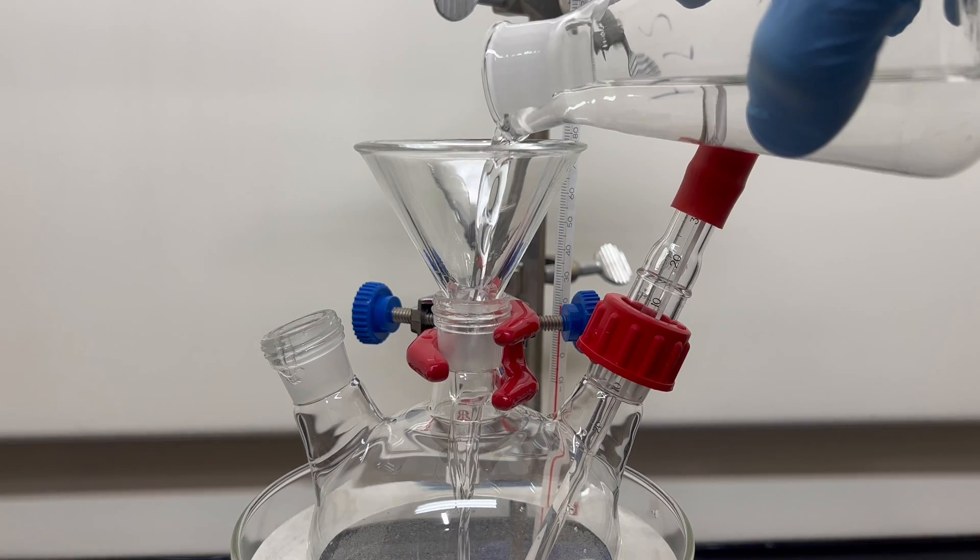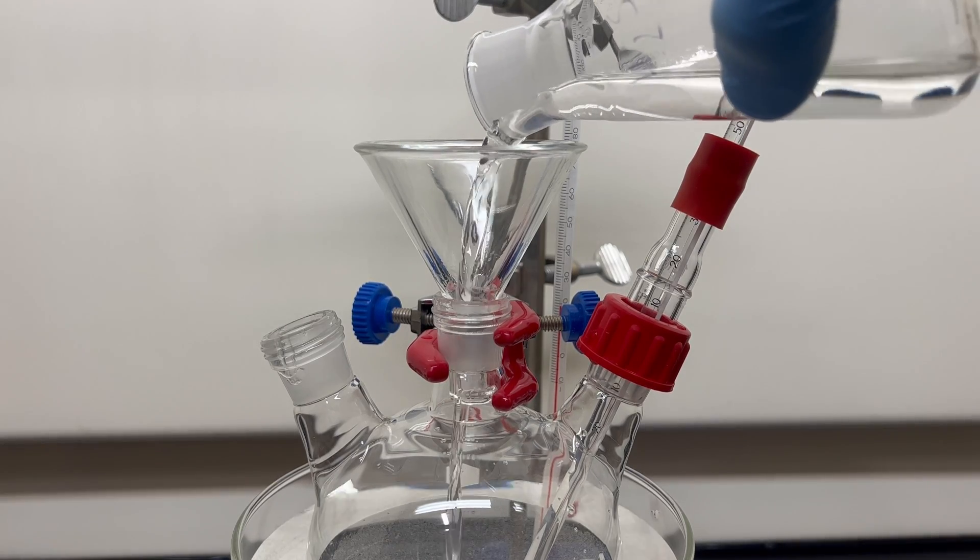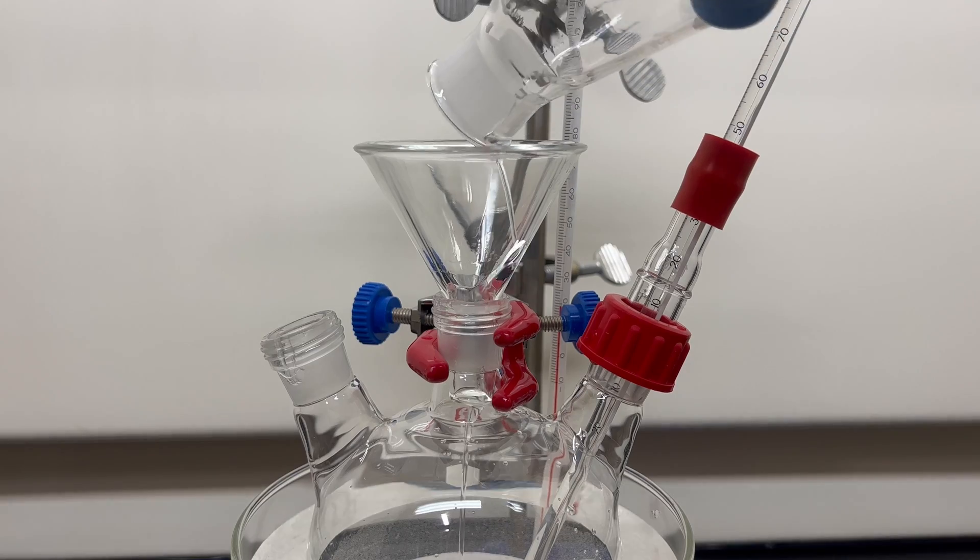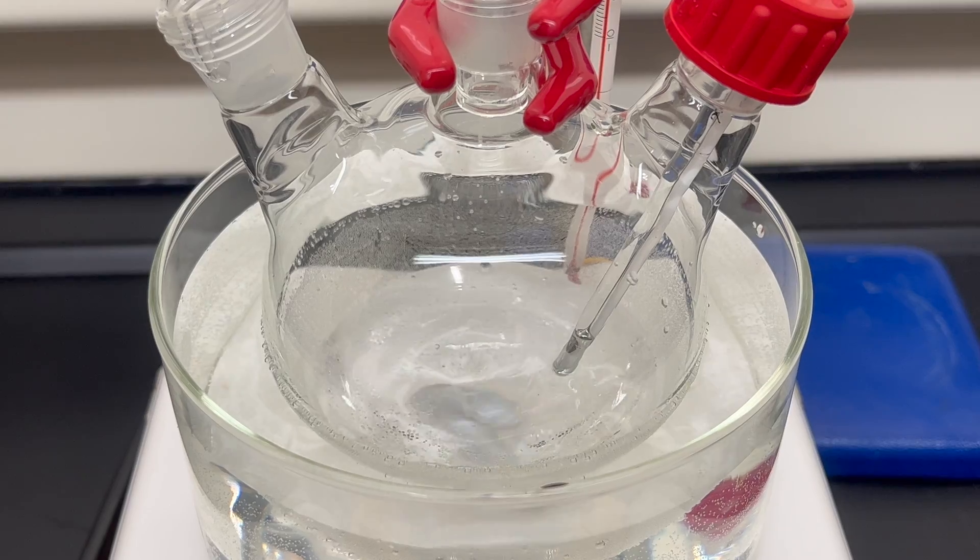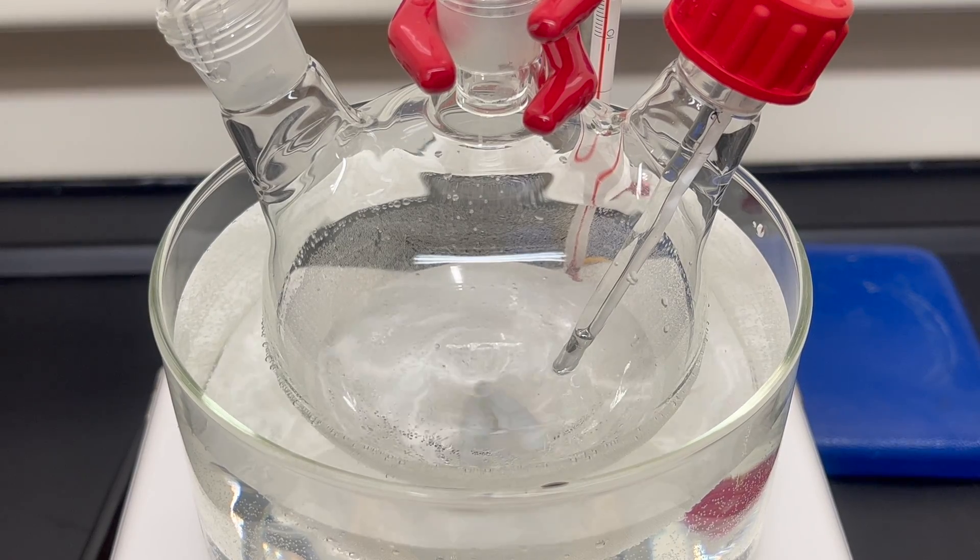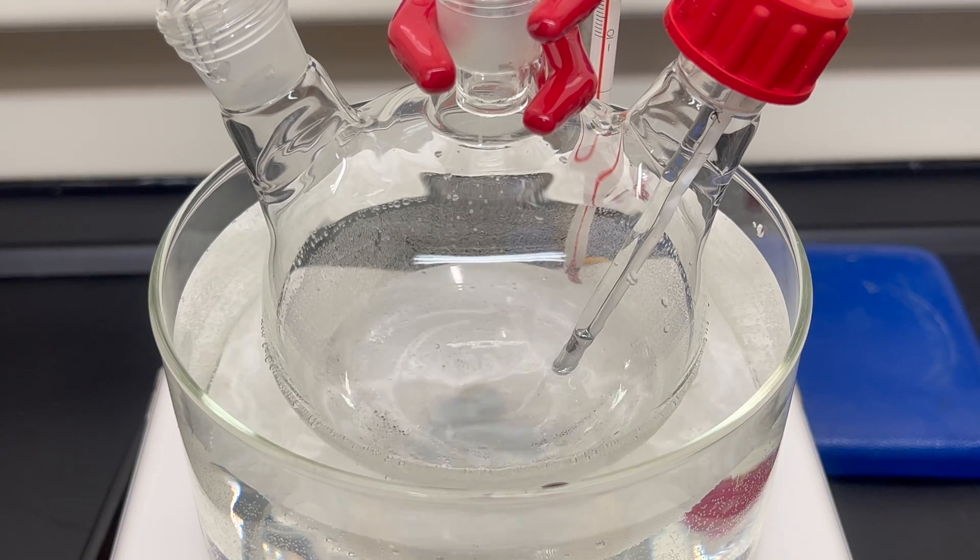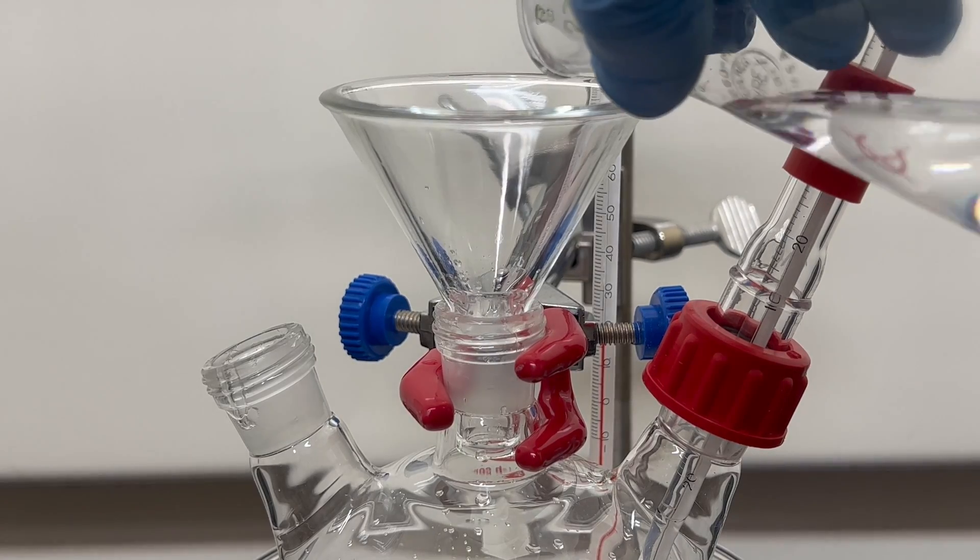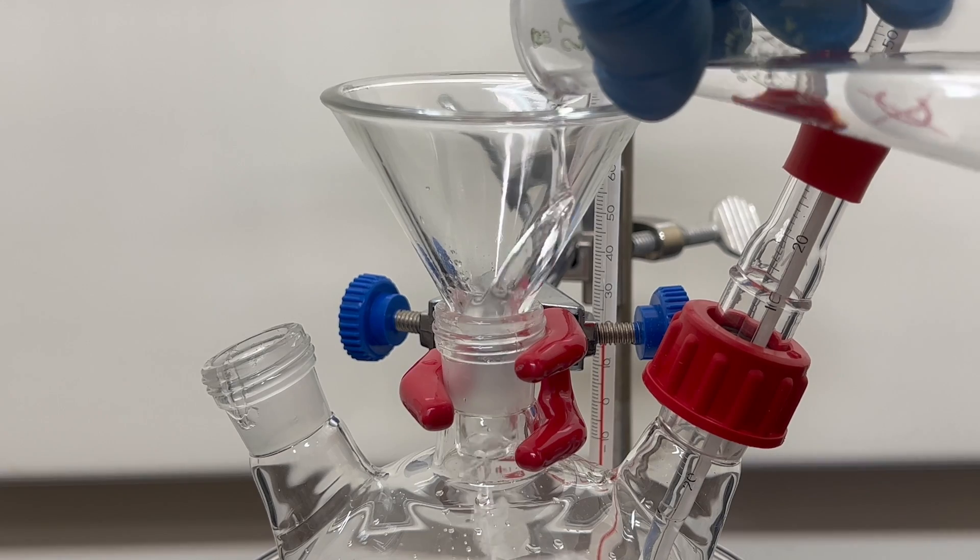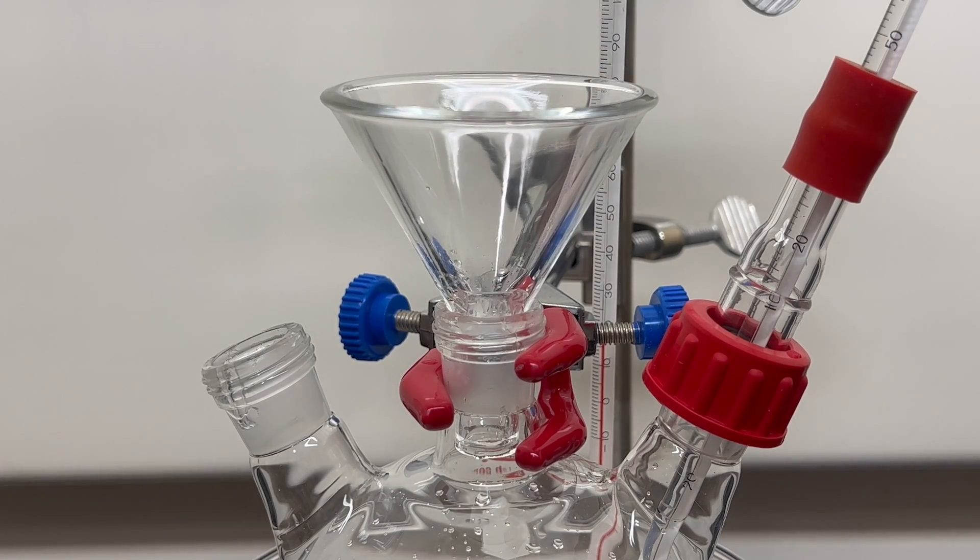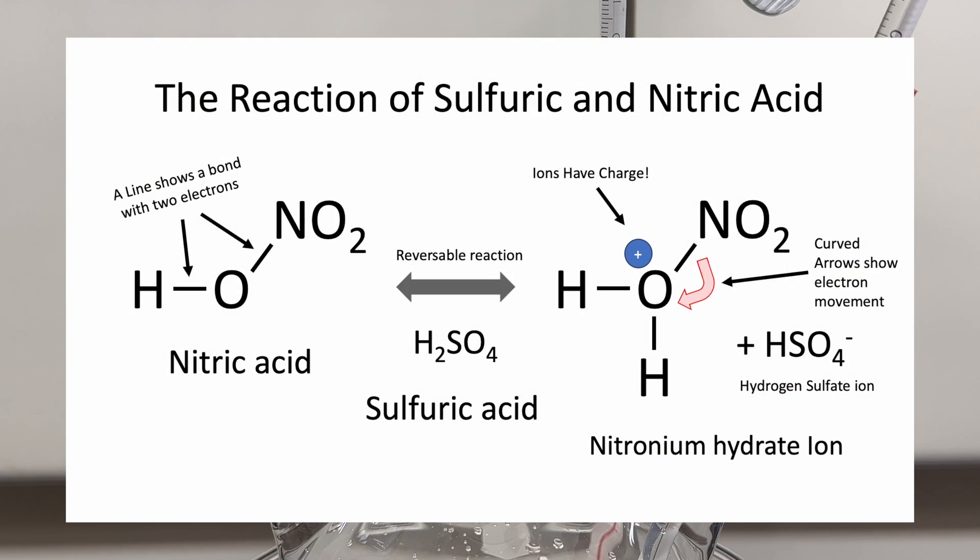To begin, 80 milliliters of concentrated sulfuric acid is added to a 500 milliliter round bottom flask in a water bath, and a stir bar is put into the flask. Stirring is started and 70 milliliters of nitric acid is slowly added. An exothermic reaction occurs here and needs to be added slowly.